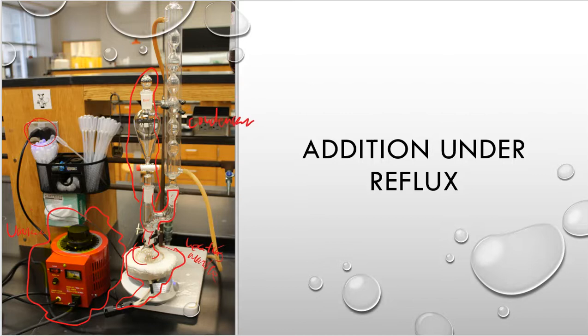And that condenser's job is to condense any vapor that might form throughout this analysis and throughout the procedure. So I'm going to heat this up. I'm going to generate some fume. That fume is going to go up into the sidearm or this U adapter. And then sooner or later, it's going to whoop, up into the condenser.